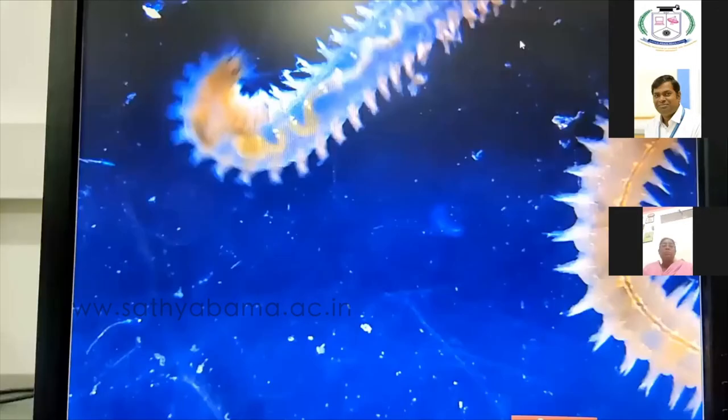I would like to share some of the video we took from our lab, our center. This worm we collected from Adyar estuary. The reason we are sharing this video is to show how the internal organs are arranged in the polychaete worm.